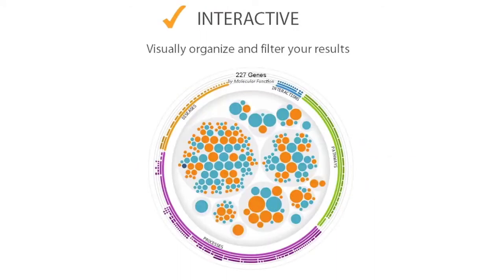iReport provides many tools that help you visually organize and filter your results, so you can quickly narrow in on the biology most relevant to your own experimental question. For example, here we're viewing all the genes iReport has identified as significantly differentially expressed in your experiment.